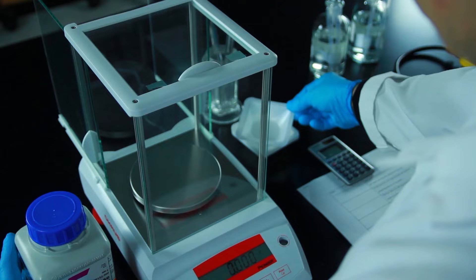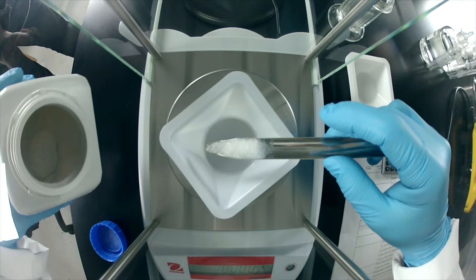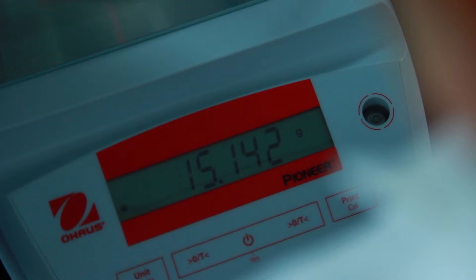Next we need to weigh out the Tris. Place the weigh boat onto the balance pan and press the tare key. Use a lab scoop to add 15.14 grams of the powdered Tris buffer. The measurement should be within plus or minus 0.02 grams.